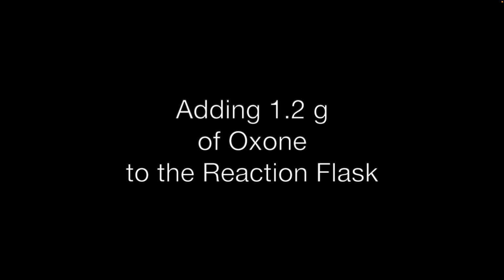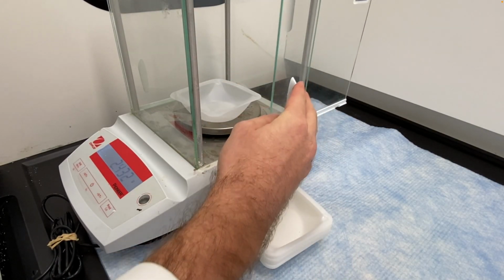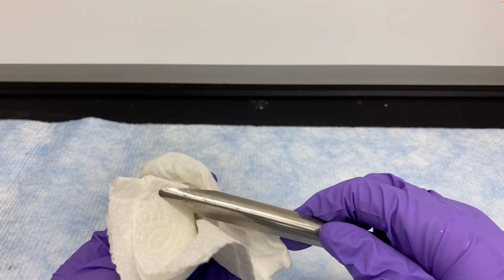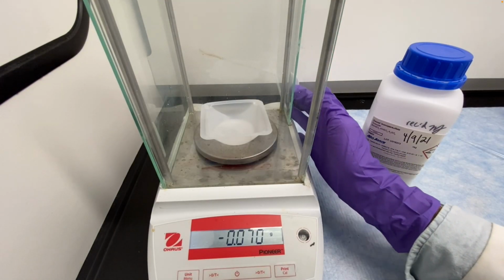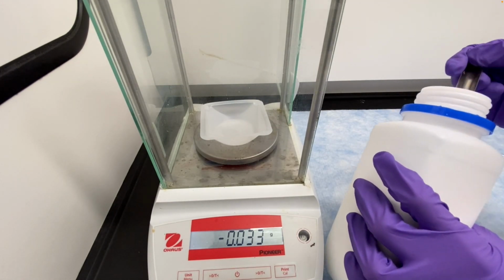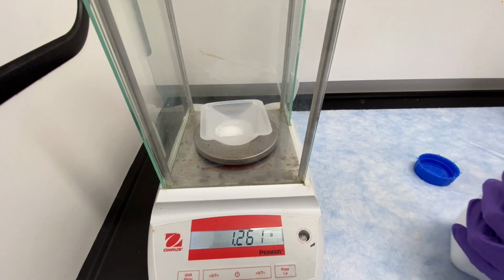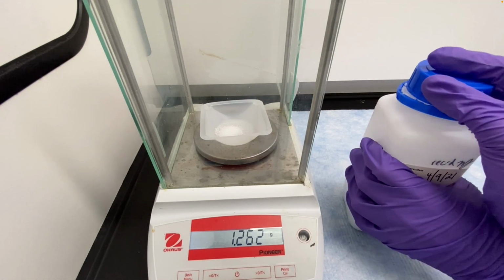So we're going to measure out 1.2 grams of Oxone. It's a white solid just like before. So you put the weighing boat on the balance, you tare the weighing boat. Now we're ready to measure it out. Our spatula is dirty from the Borneol, so we clean it off with a damp paper towel and make sure you dry it with a dry paper towel. And so now we have our Oxone. So you take a scoop of it, and notice as I'm getting close to the amount, instead of dumping it, I'm putting it over and shaking the spatula so that it sort of rains down in a more controlled way.